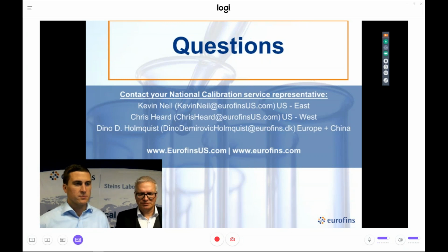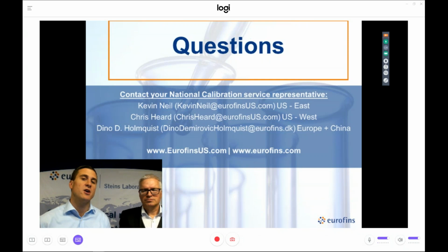Our next question, do you provide customized reference material, for example, manufactured on a customer-specific milk? Yeah, that's also a possibility. We already have, say, in the US, different types of customized milk. That could be milk based on a geographical basis, either from the north or the south or the east or the west. We can do special seasonal offerings or seasonal products like ice cream mixes, which are not always seasonal everywhere, but at least eggnogs or some other types of products. So definitely yes.